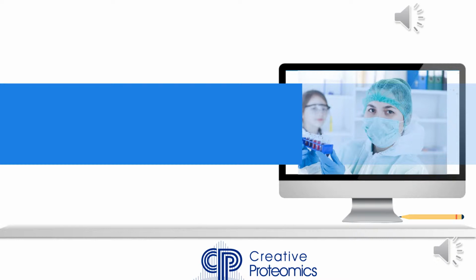Today, we are going to introduce phosphorylation analysis by mass spectrometry.